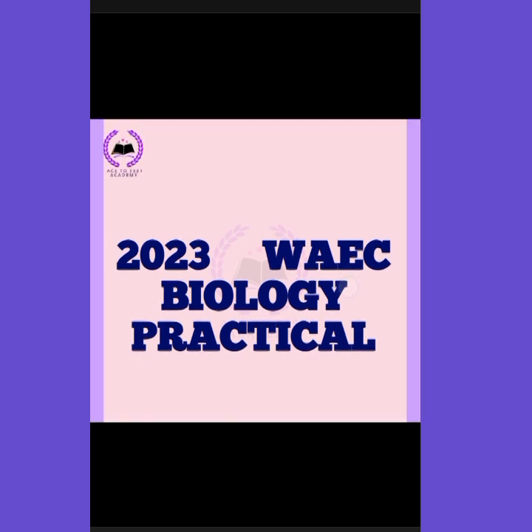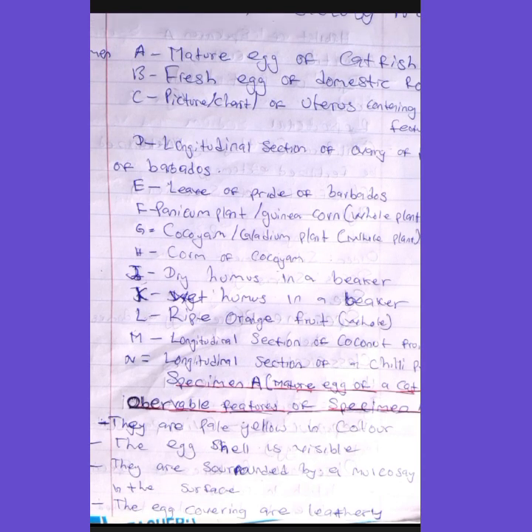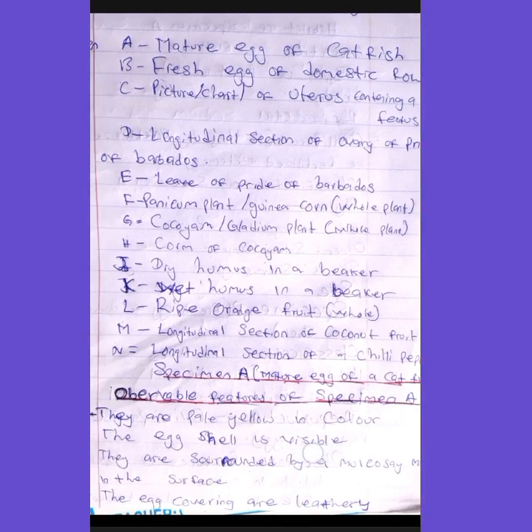We'll be looking into the 2023 WAEC practical for biology. Let's get into the specimen. Let's start from specimen A, which is a mature egg of a catfish.